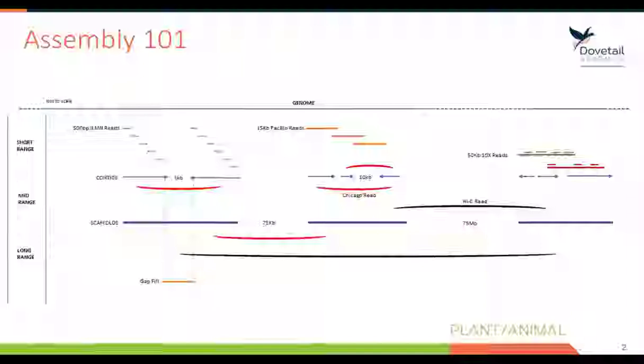What I'm going to do is take you through the process of building a de novo assembly at Dovetail. This first slide serves as a primer for de novo assembly. I'm sure there are people on the line here that are new to de novo, and I want to make sure that everybody understands this information. So I'm going to explain some of the terminology as I go along. This slide also summarizes what Dovetail does in a single year.